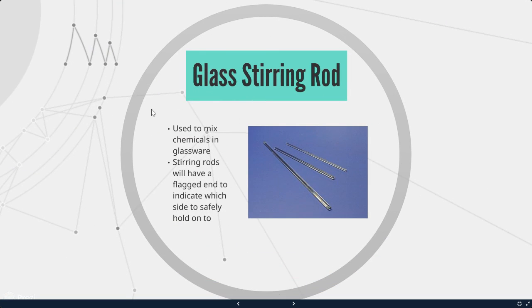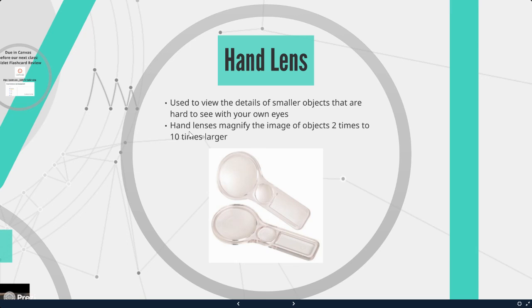We have glass stirring rods, which are used to mix chemicals in glassware. Stirring rods will have a flagged end to indicate which side to safely hold on to. Be very careful with these — the instructor actually cut themselves using one to stir a sugary liquid. Hand lenses are used to view the details of smaller objects that are hard to see with your own eyes. They magnify images two to ten times larger. We'll be using hand lenses to see iron particles in cereal.